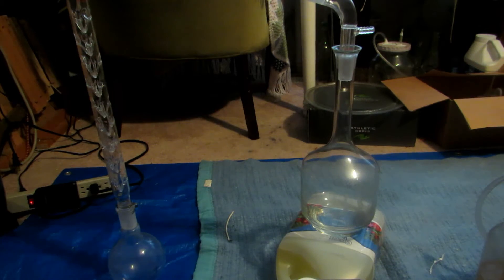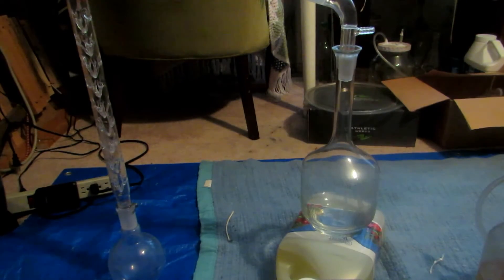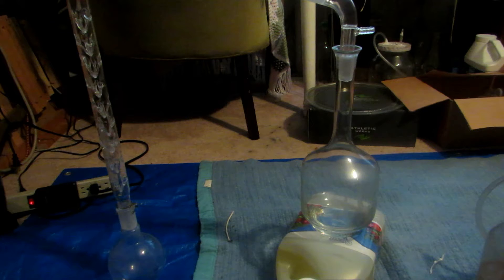I quickly wrote up the boiling points: dichloromethane forms an azeotrope with methanol which boils at about 40°C, where it's 93% dichloromethane and 7% methanol. Then methanol boils at 64.7°C, and toluene boils at 111°C. There's a fairly good separation between all three liquids, so we probably should not need to use a fractionating column.